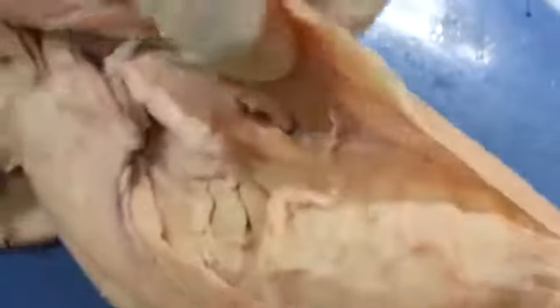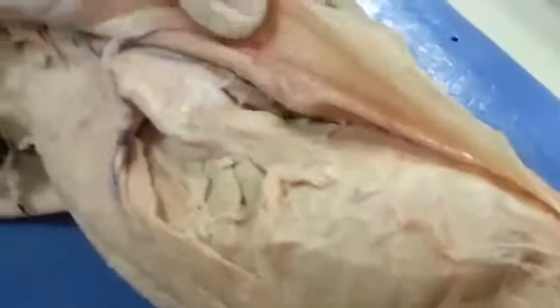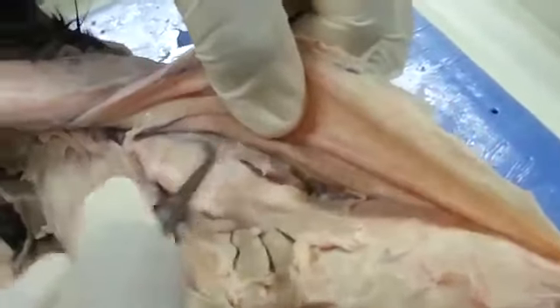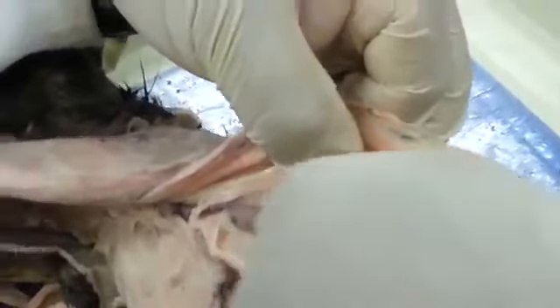So we go to the deep chest here. Reflect the latissimus dorsi. This would be the spine of the scapula. So this muscle here, large visible muscle on the scapula, would be the infraspinatus.